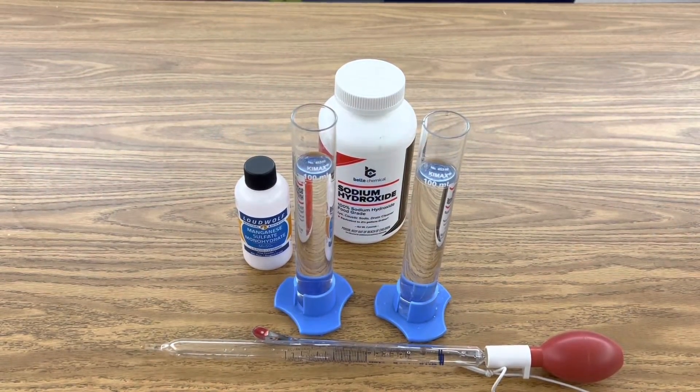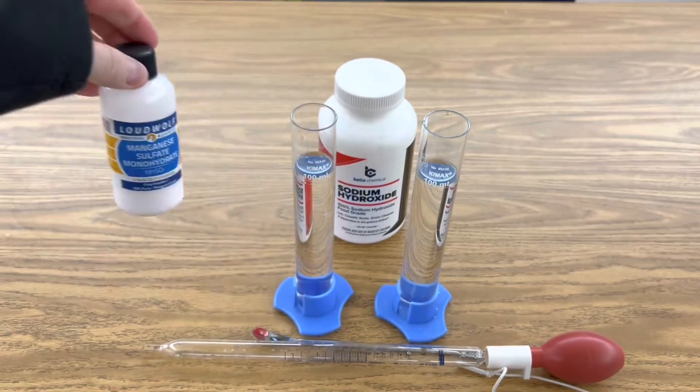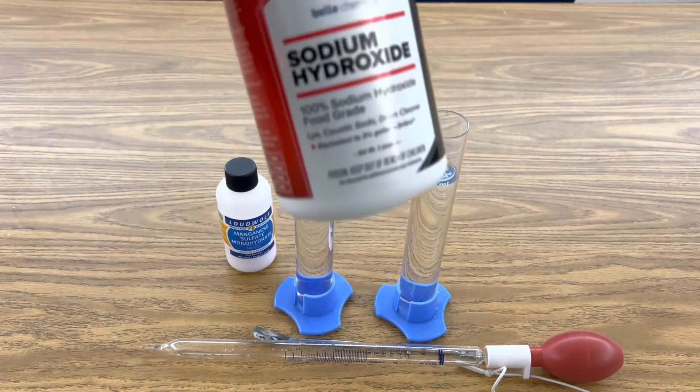All I'm using in this investigation are two graduated cylinders with 100 milliliters of distilled water, manganese sulfate, sodium hydroxide, my spoon, and a dropper.